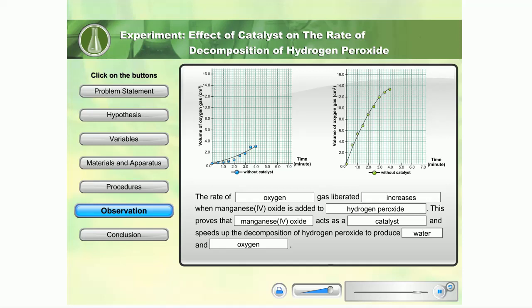The rate of oxygen gas liberated increases when manganese 4 oxide is added to hydrogen peroxide. This proves that manganese 4 oxide acts as a catalyst and speeds up the decomposition of hydrogen peroxide to produce water and oxygen gas.